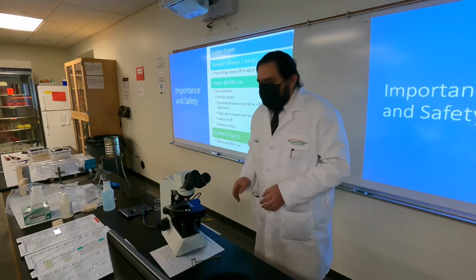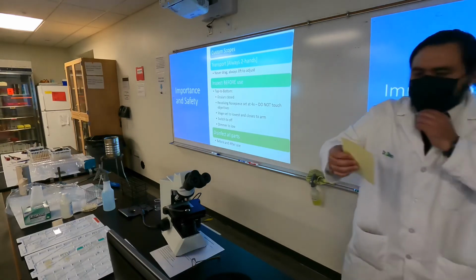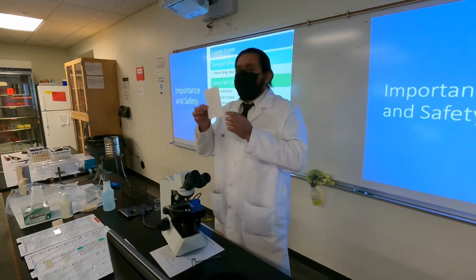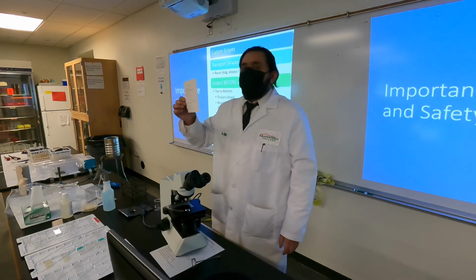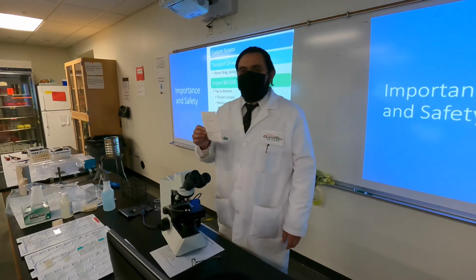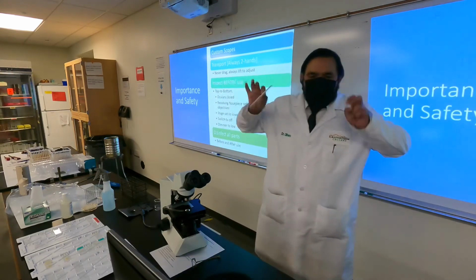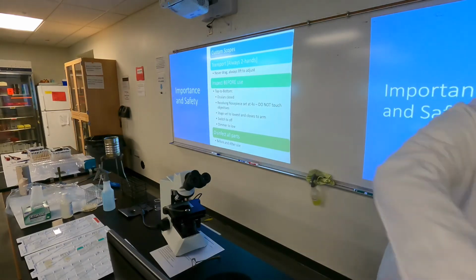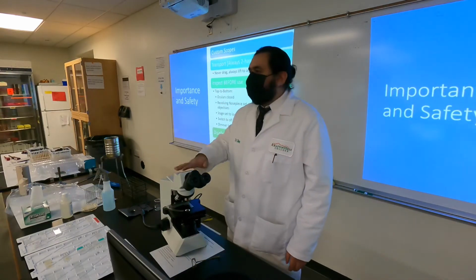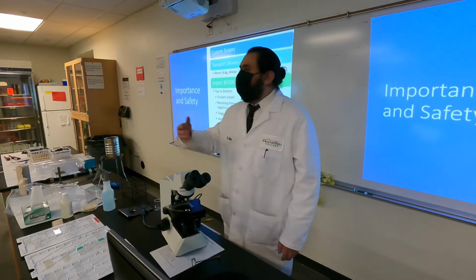And in the event that something goes wrong, one of the things you're gonna find out, that we have these cool little sheets that are report sheets. If you find something wrong before you use it, fill this bad boy out, keep a copy and bring me 1 copy. That way we know who to blame. That way you don't get charged for whatever damage occurred to this guy. Okay? So these are our little tattle sheets, if you will, to let everybody know that you didn't hurt it, somebody else did. Okay? So let's go through this kind of a quick top to bottom thing before you do anything else with it. So let me demo, then follow basically.